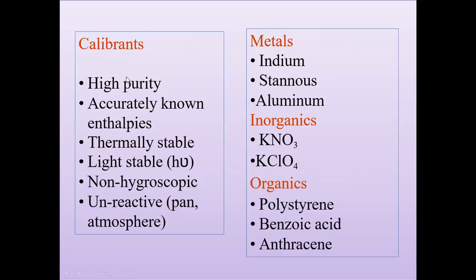When you are using your calibrants, they should have some ideal properties. They should be of high purity with accurately known enthalpies.